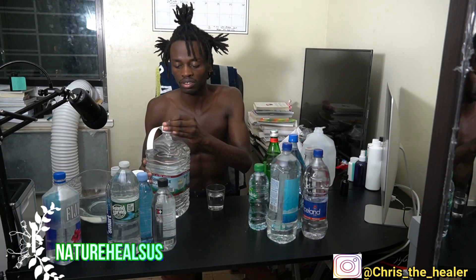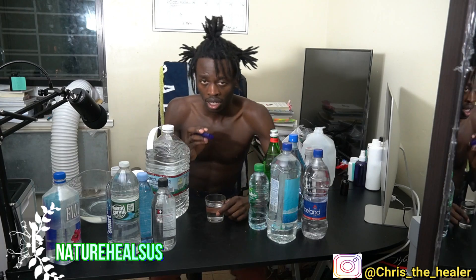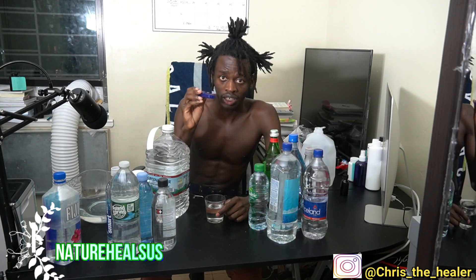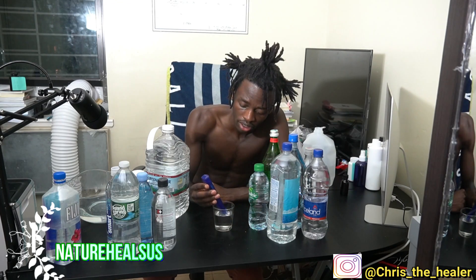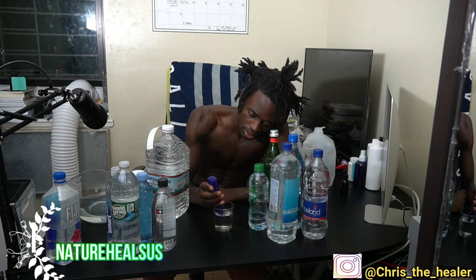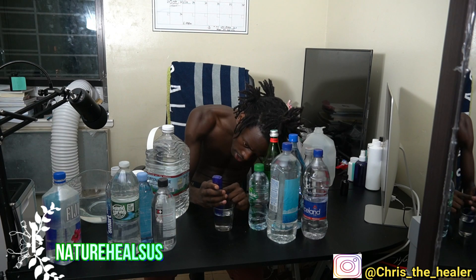I've got the TDS meter. It's at zero PPM, zero parts per million. Our objective is to figure out how much is dissolved in this water. I'm going to dive in and just hold it there for a few seconds. I have a reading of 190 parts per million — that's how much is dissolved in Crystal Geyser. Is it really benefiting us? I don't think so.